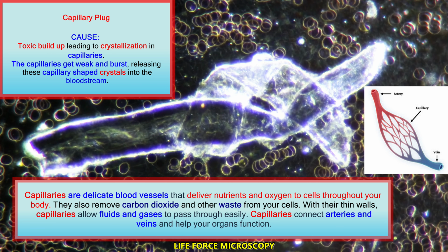So what you are looking at is not an artifact created by dust on the slide. On the contrary, it is a crystal in the shape of a capillary. These things are waste products that do not exist within the body.